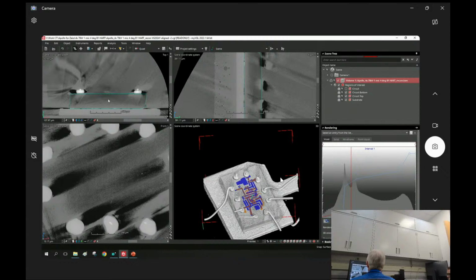A lot of scatter in this. I can see the substrate, and there's things that you can see very easily. But this was open. They had taken the packaging off of this, so I was looking at basically a bare surface here surrounded by gold wires.